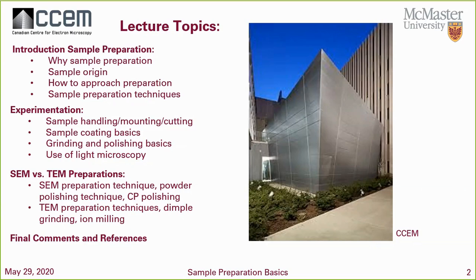In terms of experimentation, I'm going to show you how to handle the sample. I'm going to show you some tips on how to cut it, how to mount it, and especially I'm going to talk a little bit about coating. Coating is extremely important in terms of preparation, especially for electron microscopy preparation. I'm also going to talk a little bit about grinding and polishing basics, which are extremely important.